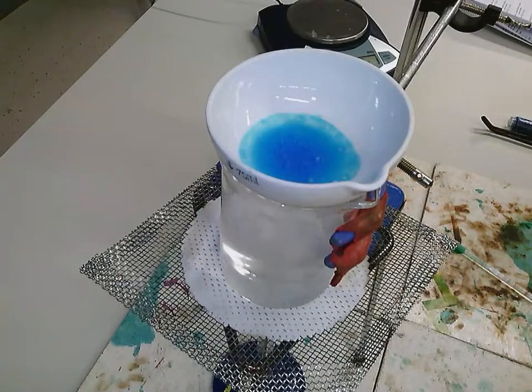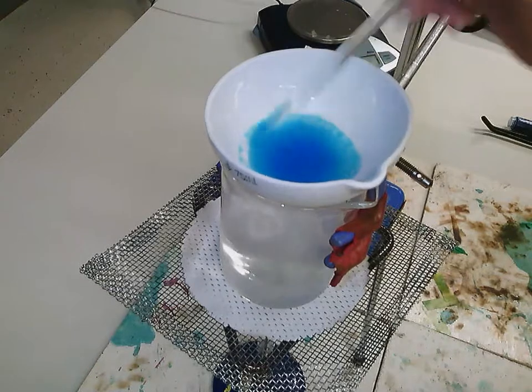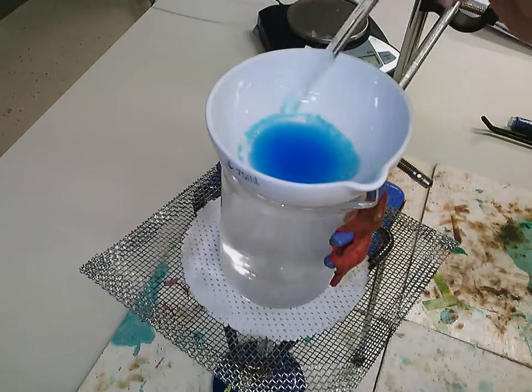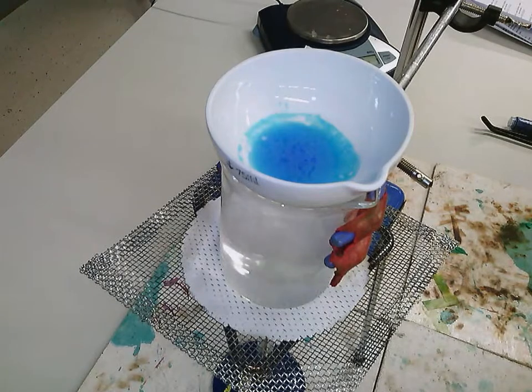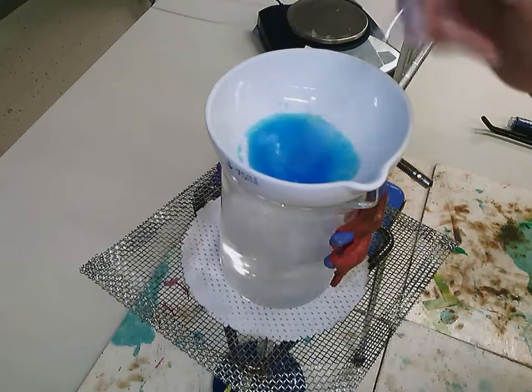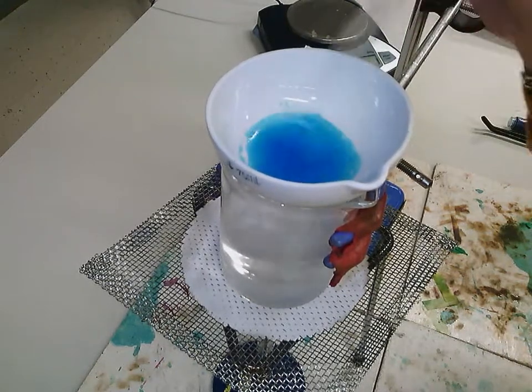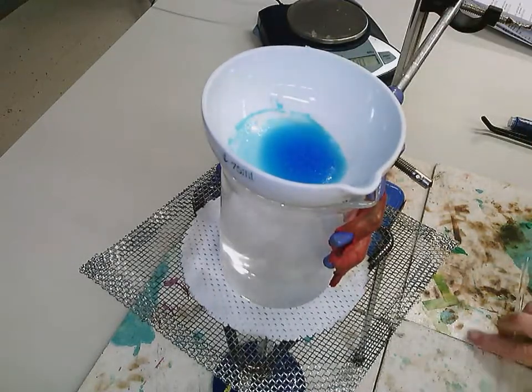Again, you can see we've got to the point of crystallization. So it's actually starting to turn into little blue crystals. So this is a point where normally we would then put it in a window because it takes such a long time. So it's been boiling here for about 30 minutes to get to this point. But in this case, we're going to just keep heating it until it turns into a white powder. So I'm going to pause it again, and hopefully at that point nearly all this liquid will have evaporated, leaving just copper sulfate crystals.